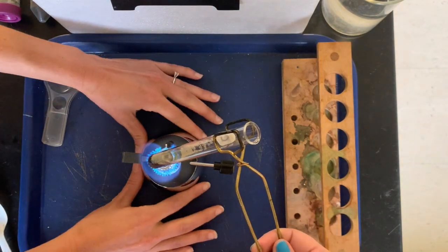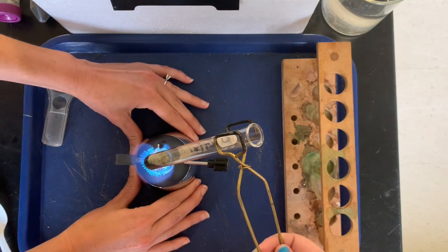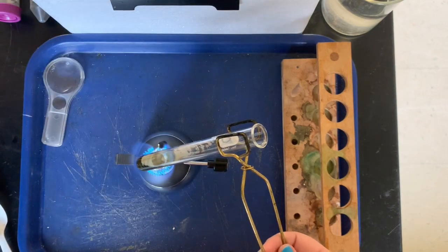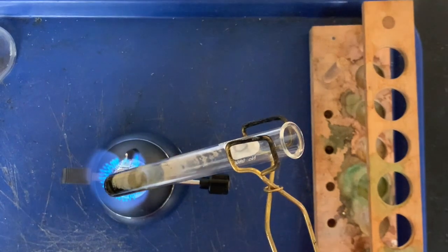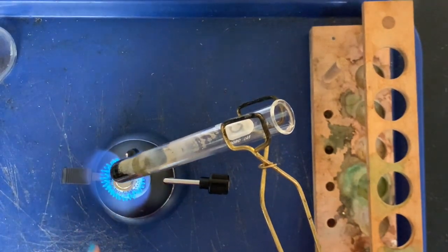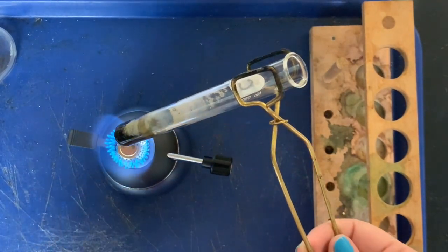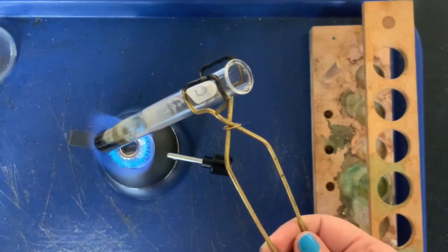You can already see, though, you can already see it turning black. We could maybe zoom in on the camera. Yeah, can y'all see that, there at the bottom of the test tube? It's changing color.